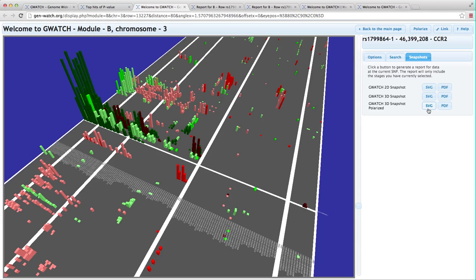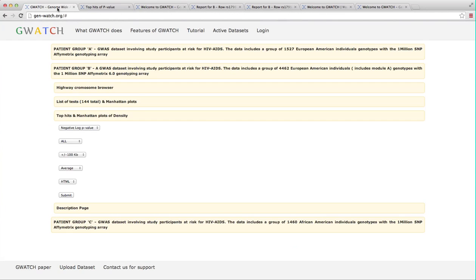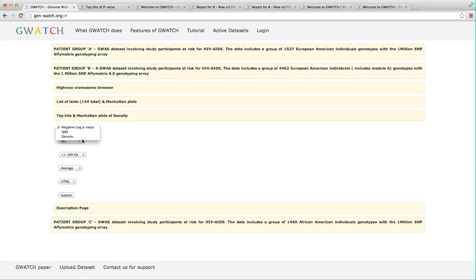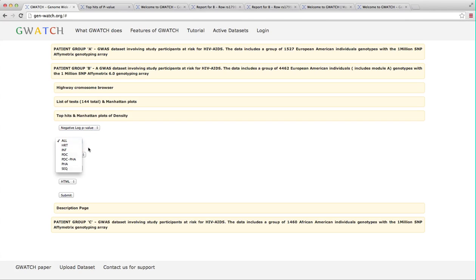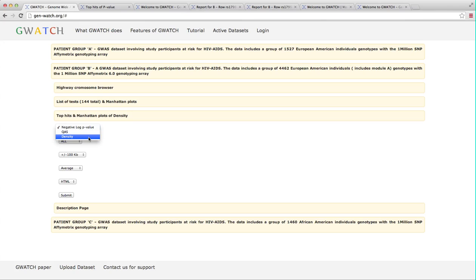Now, let's return to the active datasets page. We can also search for hits, not only by top p-values, but also by maximal QAS for all stages of AIDS or by selecting just one stage, such as HIV infection tests only. GWATCH also introduces a new search parameter called density.